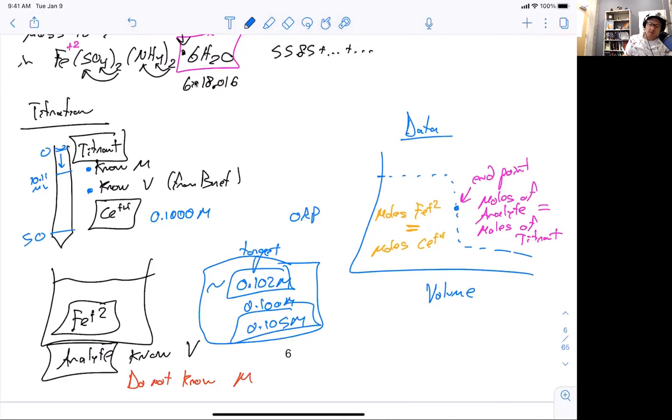This is ideal. This is 0.105 molarity ideally. But again, we're going to test it and see how close to this 0.105 molar it actually is. It's kind of a weird thing, because you weigh out a certain amount, and you could do the calculation, but when you go from molarity to moles to grams, that's assuming 100% pure.